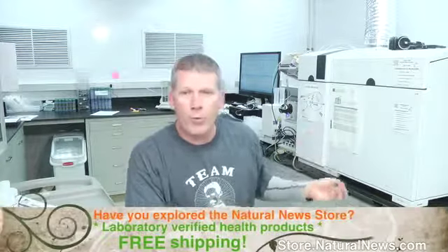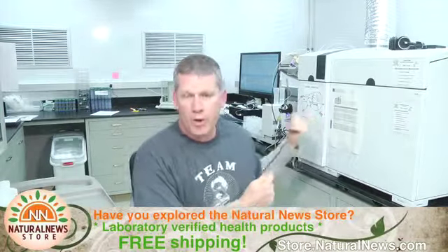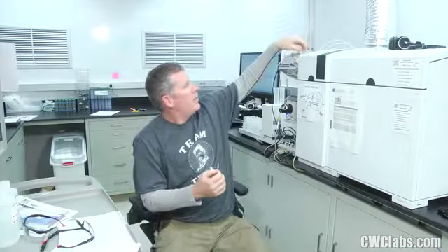What this system does is very smart. It is injecting a sample through the nebulizer at the same time that it's loading up the rinse. And then as that rinse is going through your system, it moves the probe in your auto sampler to take up the next unknown sample. So it's doubling up by using a sample loop, which is right here. This happens to be a 0.5 milliliter sample loop. You can get different sample loop sizes, 0.25, 0.75, 1 mil, whatever you need. I'm using 0.5, works great, because my total scan time is like 25 seconds or something per sample.